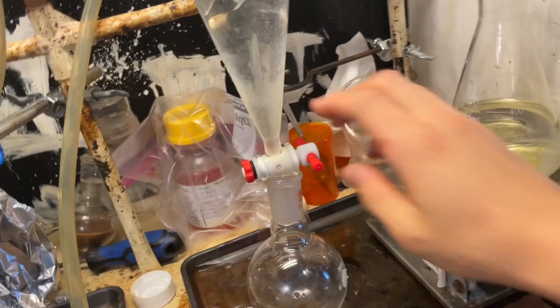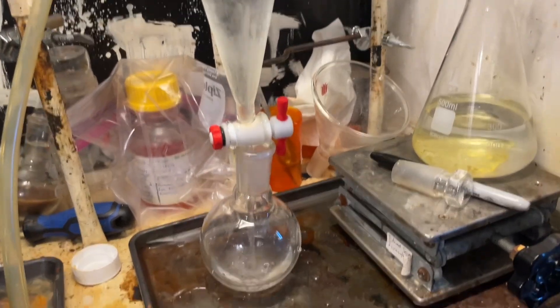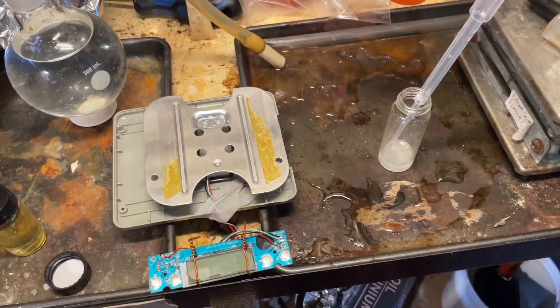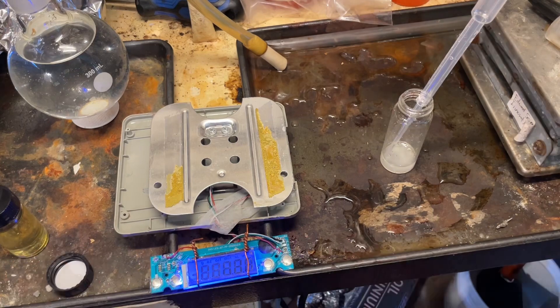It should be clear, but it's slightly yellow — that doesn't matter. You could extract the aqueous layer with some ether or dichloromethane and distill all that off to get your quinoline that way, but I found simply letting it sit overnight condenses all of the quinoline that's in suspension into one big droplet, so I just separated that out.